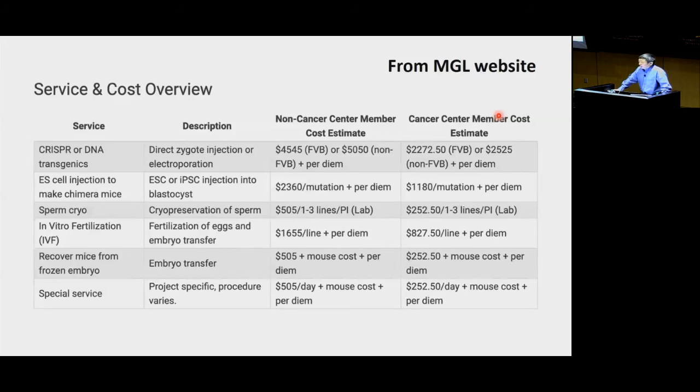For current CRISPR reagent, you can get it from a commercial company. For the prime editing, you may need some special way to prepare the CRISPR reagent. So if you can do that, it's fine for us. We can do the injection. Not a problem.